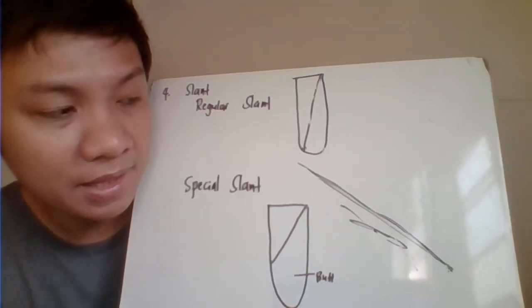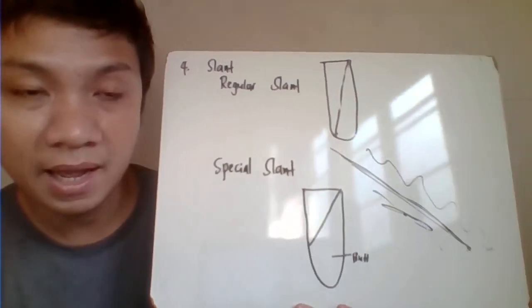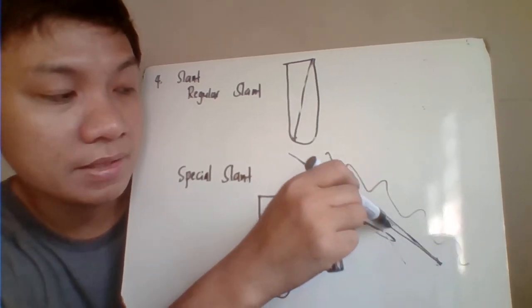Another technique, pwede siyang fish tail, pag ganun. But I think ideal ang ating straight line lang. You draw a straight line on the surface.